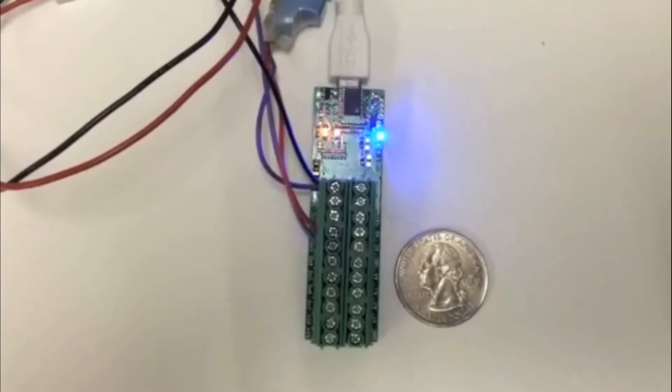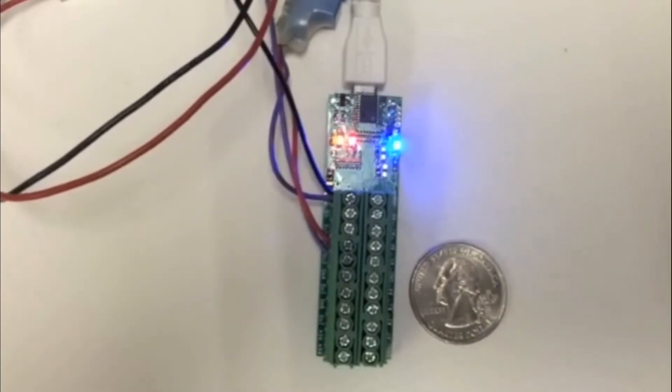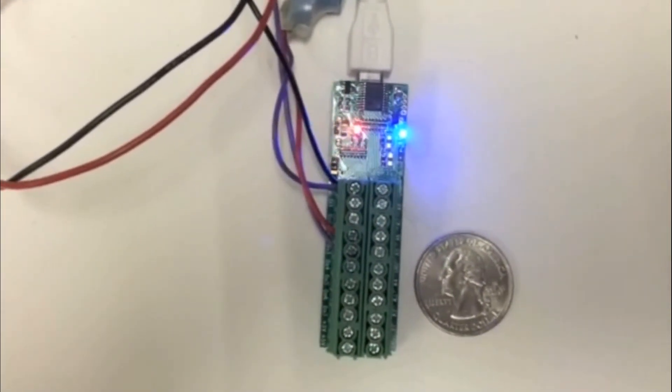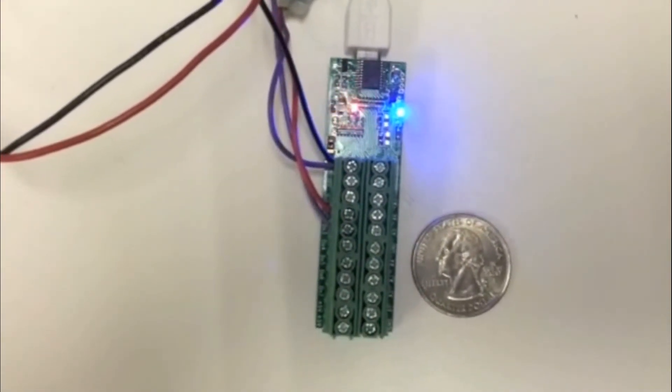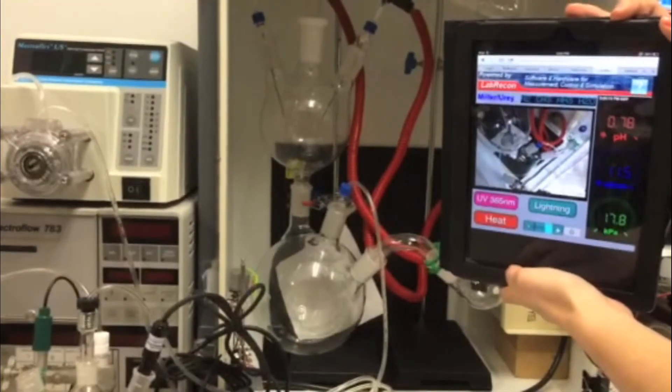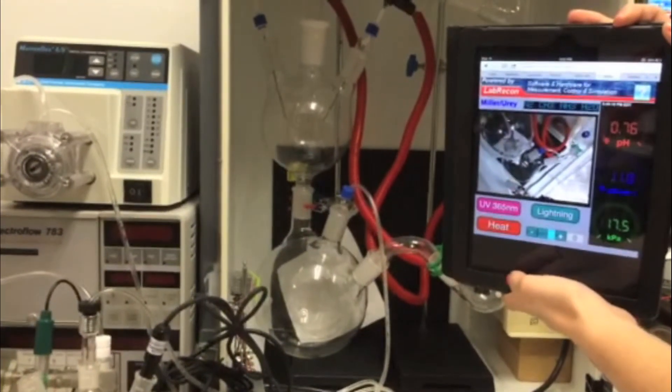Over here, the Recon MiniDAC can be seen next to a quarter. In our Miller-Urey experiment, we are using the MiniDAC to control the UV light source and lightning. Here, I have the interface on an iPad, and I'm going to demonstrate the lightning control.